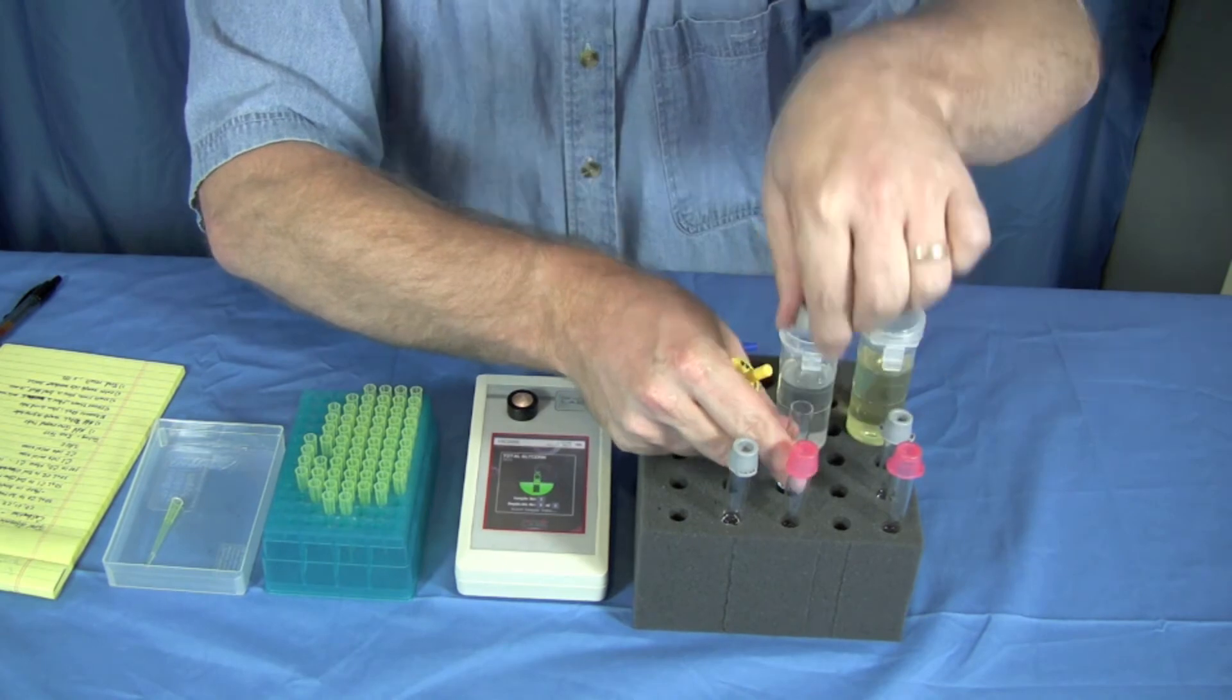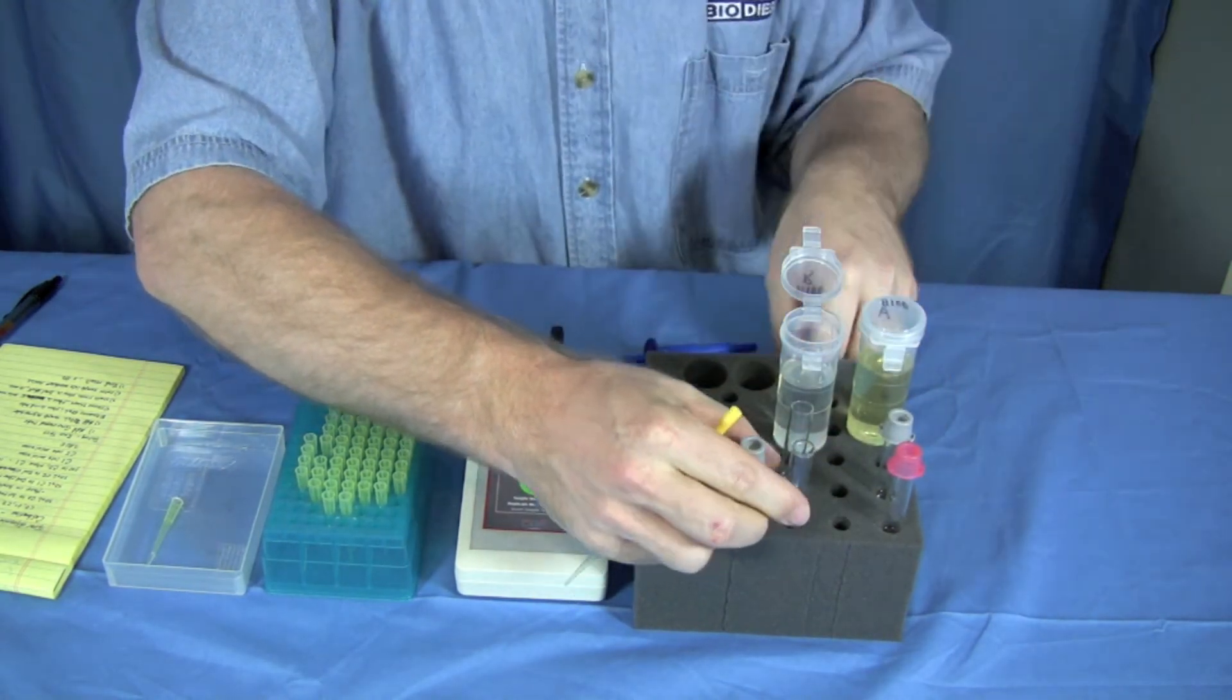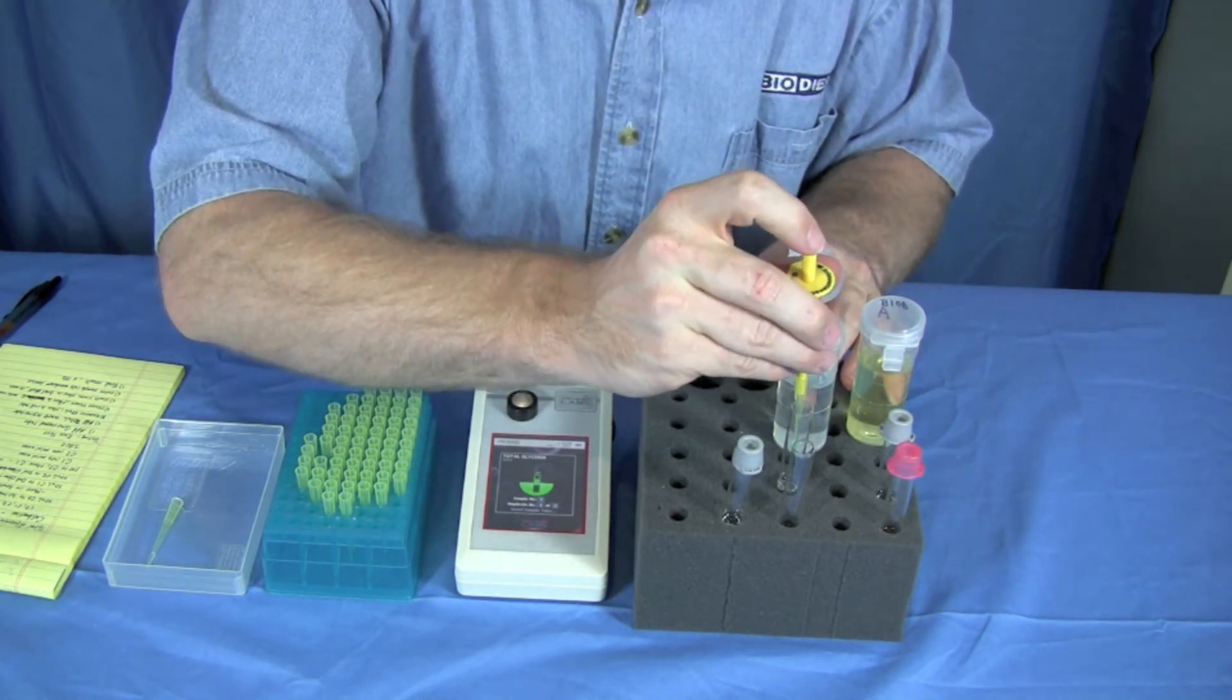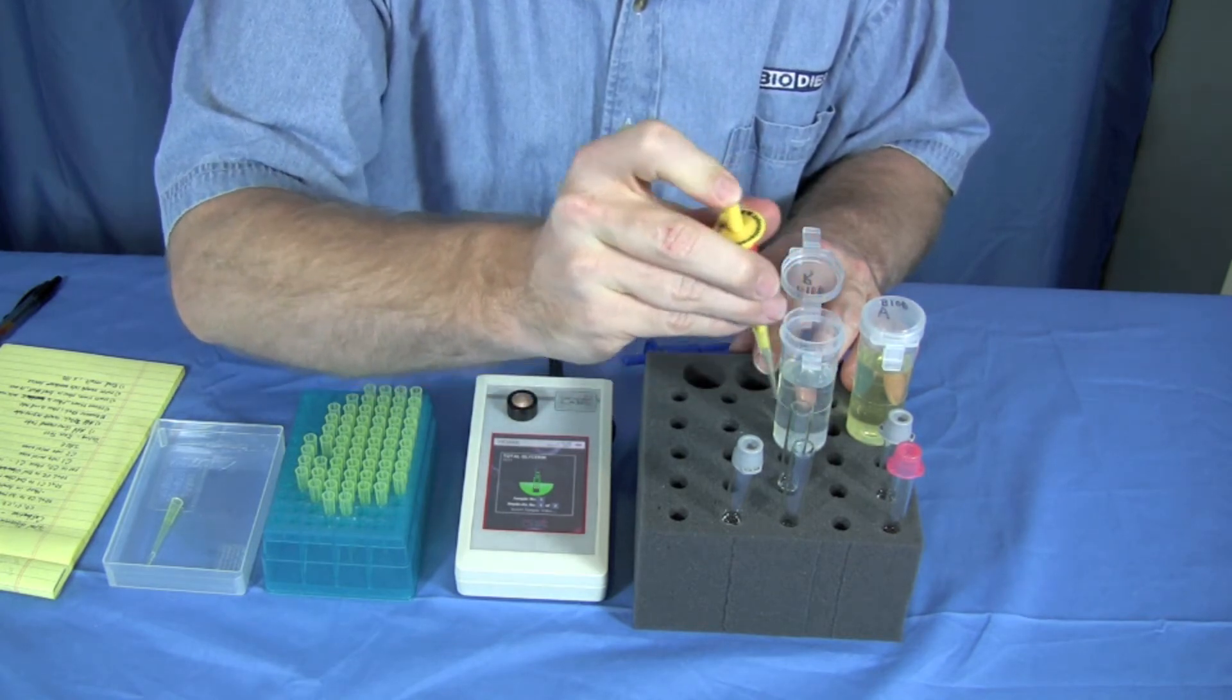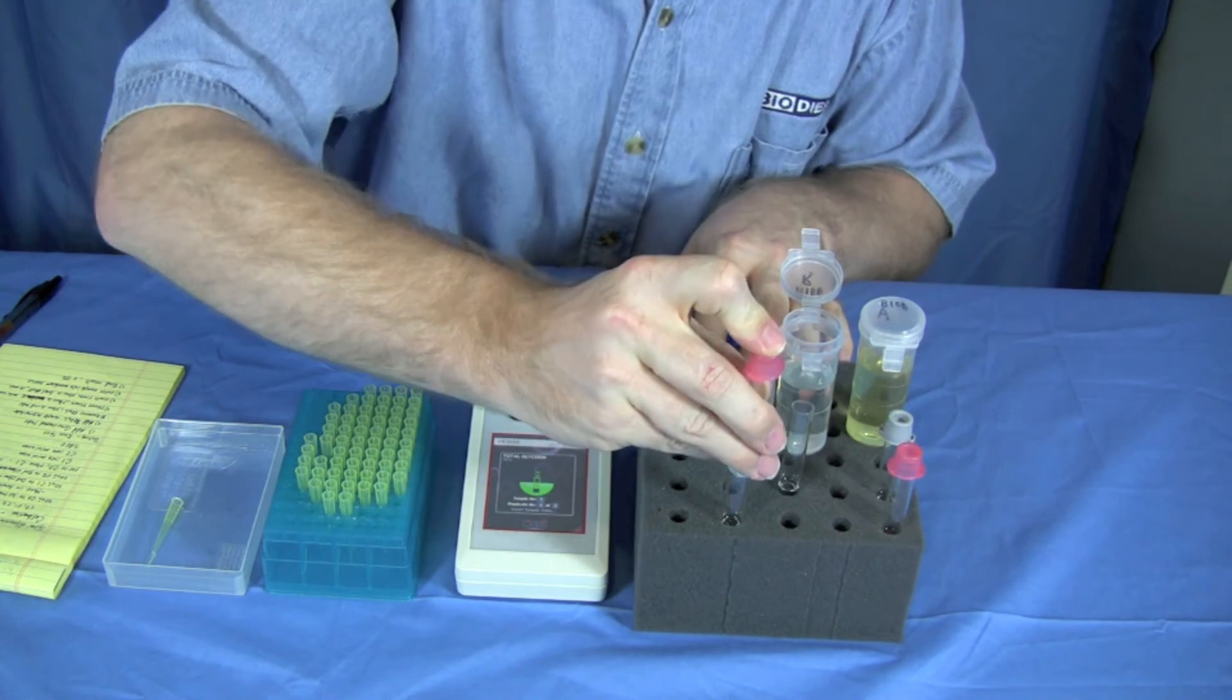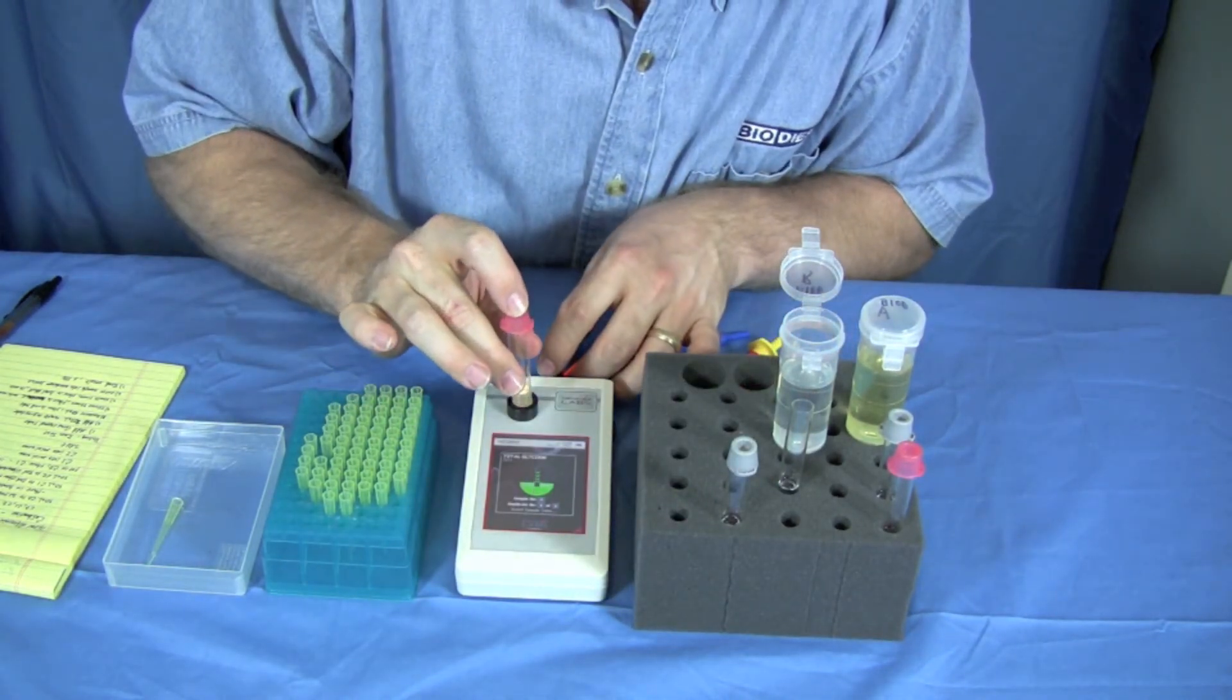We pull 50 microliters out of the dilution tube. Put it into our testing vial. We cap that. Invert it one, two, and three. And we put it into the mini scan.